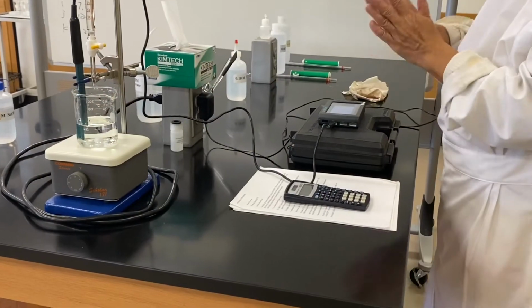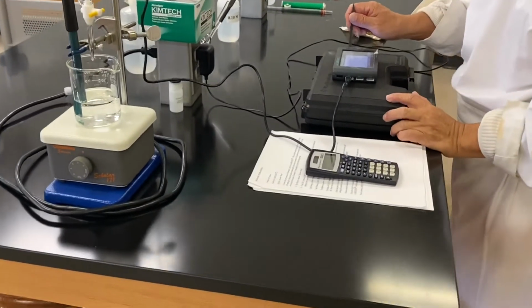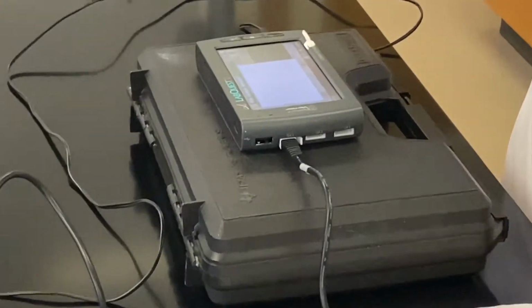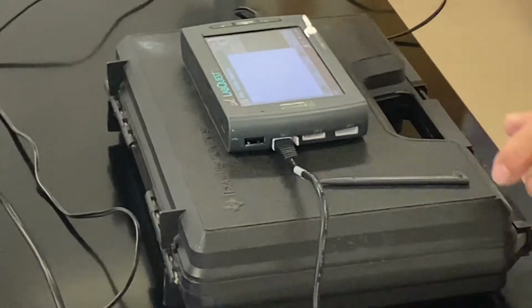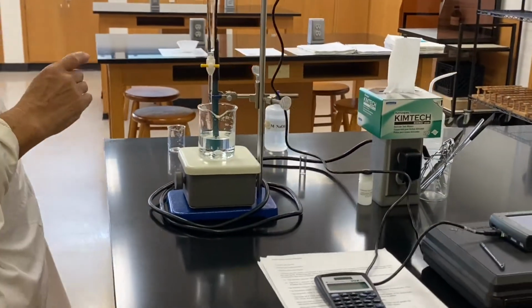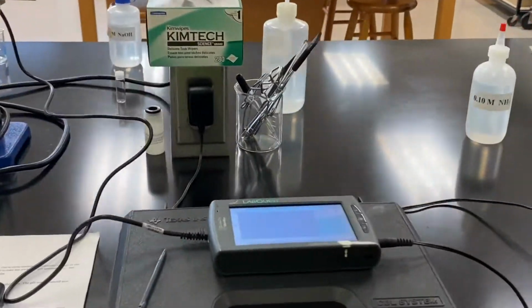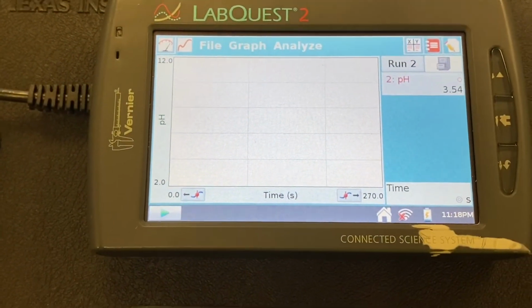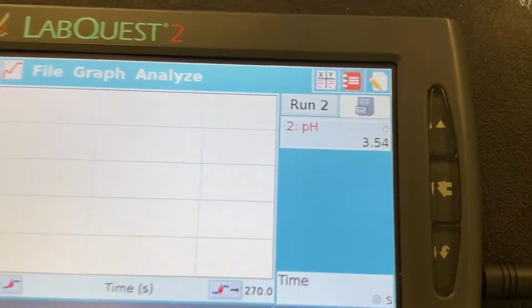Because we're going to use exactly the same programming, I will just hit the file once, and then we'll do the second run, and then that's it. All right, save some time, and then that's all. The acid system changed from strong acid to weak acid, and now your pH is increased, and that only means that our system works just fine.